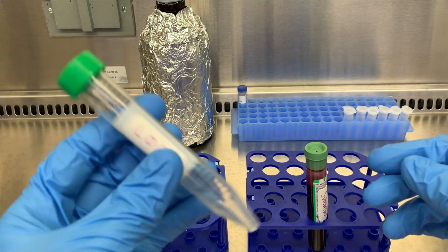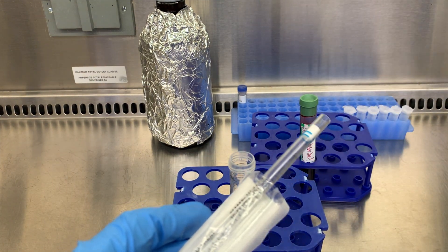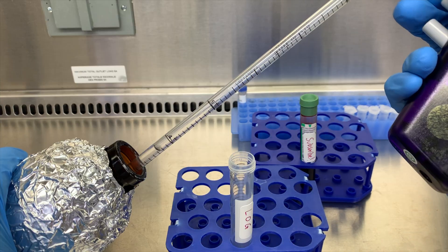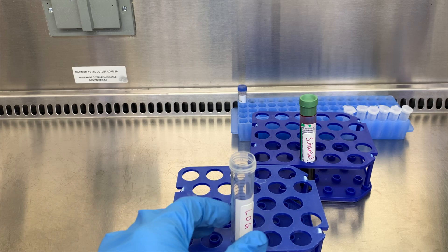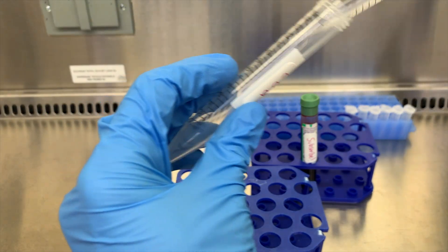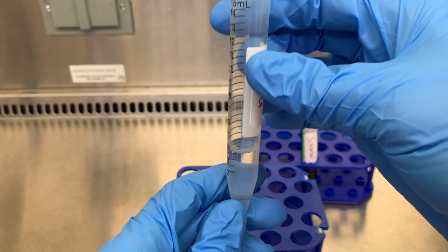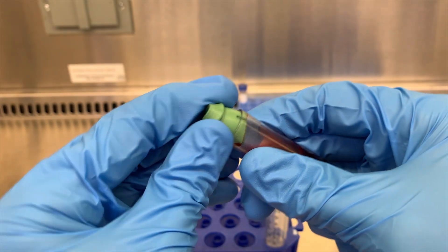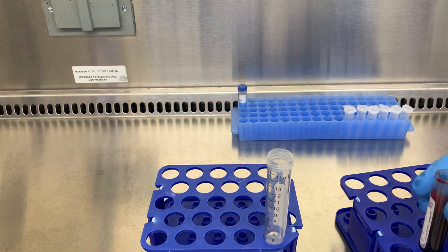I'll put 4 ml of our Ficoll into a 15 ml tube. Doesn't need to be too precise here, since 4 ml is a bit of an arbitrary number. You might need more or less depending on your volume of blood or tube size. And this does need to be room temperature, since adding cold media to blood will activate platelets, leading to clumping, even in an anticoagulated tube. This will impair the density gradient, since platelets will stick to RBCs and WBCs, so you won't get as clean of a separation.